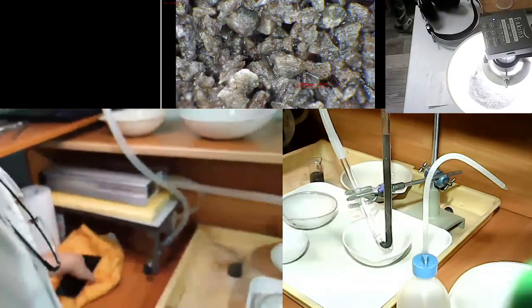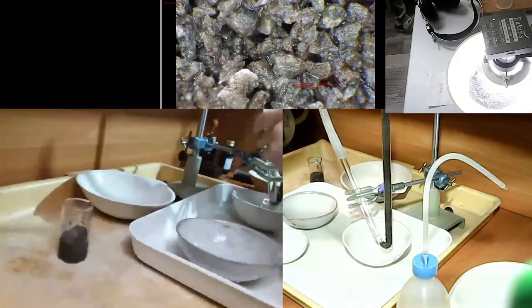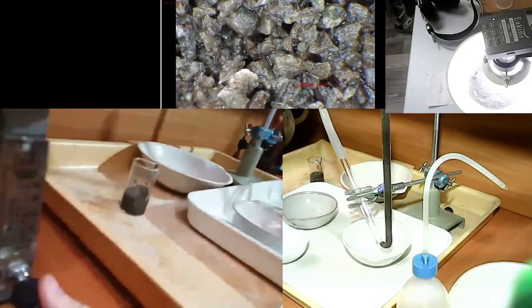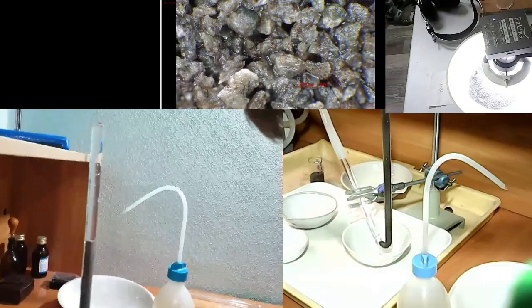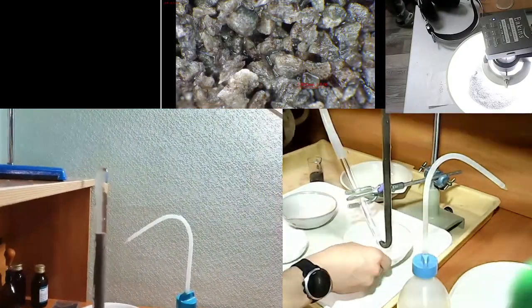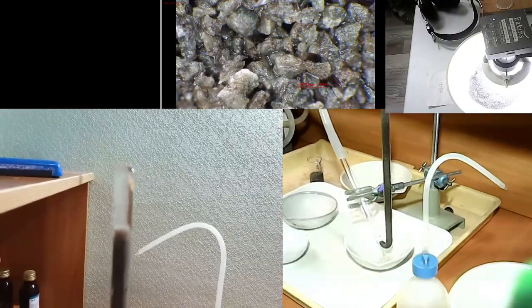The separation on the left hasn't started yet. It's just fed into the GST, and you can see this is a long GST this time. So the separation has started on the right image below. You can see the fraction is streaming up. This is the very accurate process.